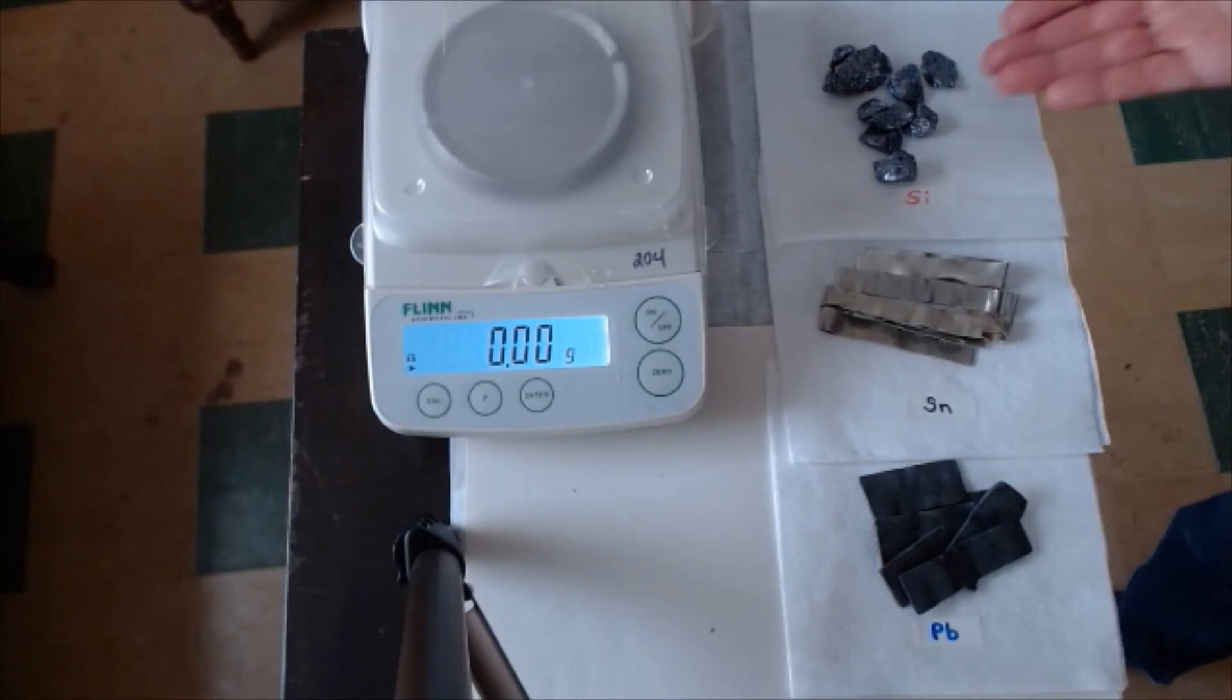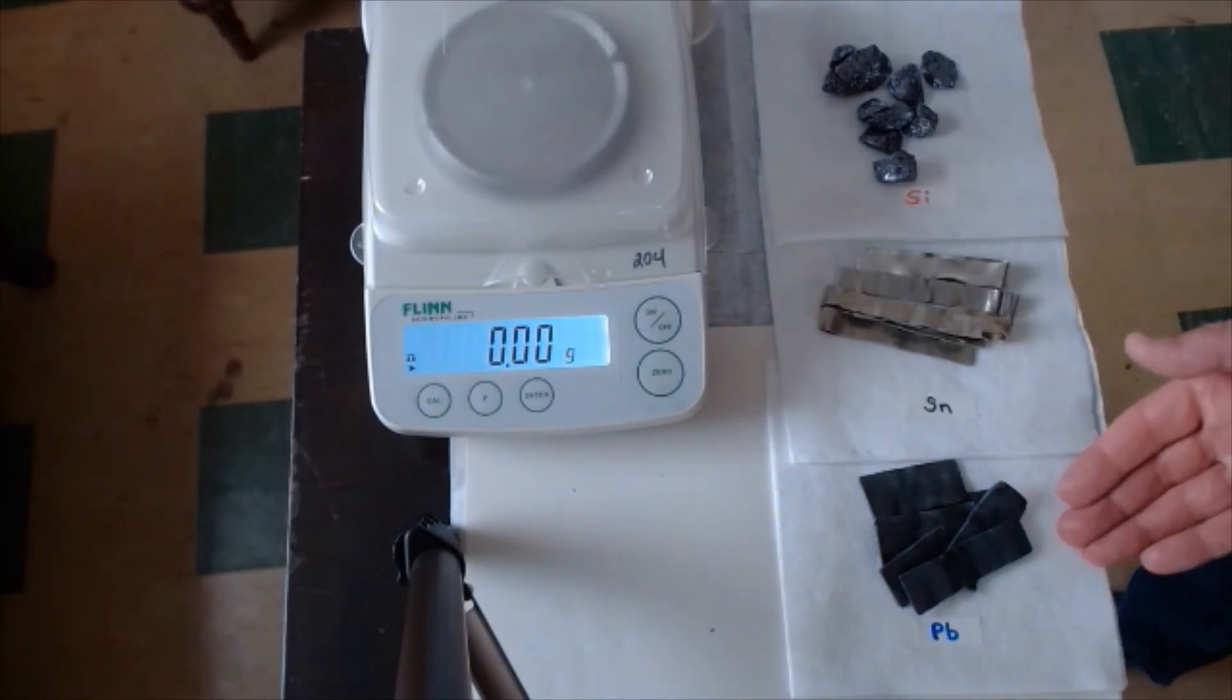Then you'll see the next step is to do a few calculations. You need to find the actual volume of each element by subtracting the initial volume from the final volume. And then using the mass and the volume, you're going to calculate the density of each element.